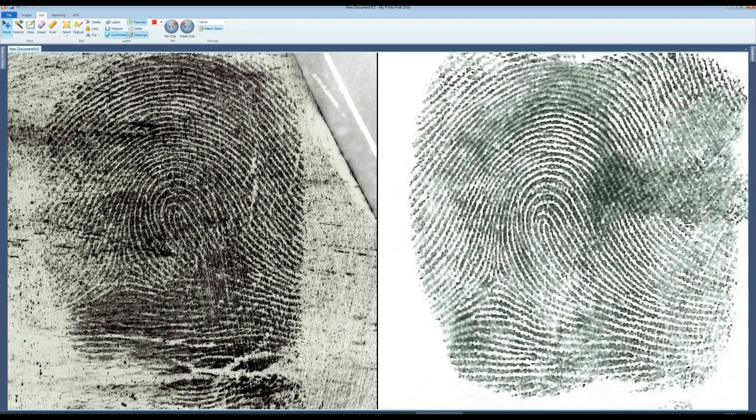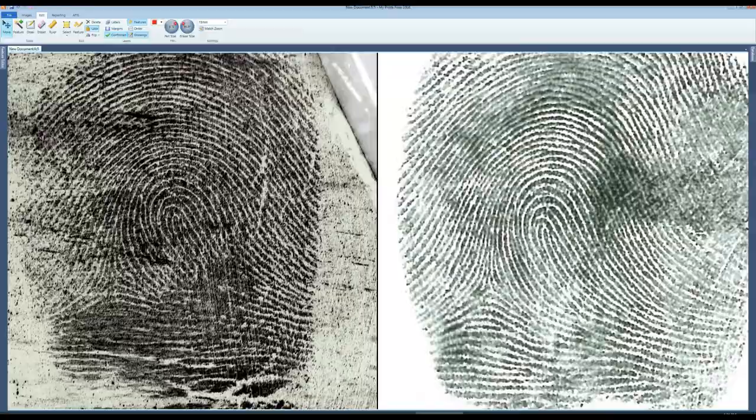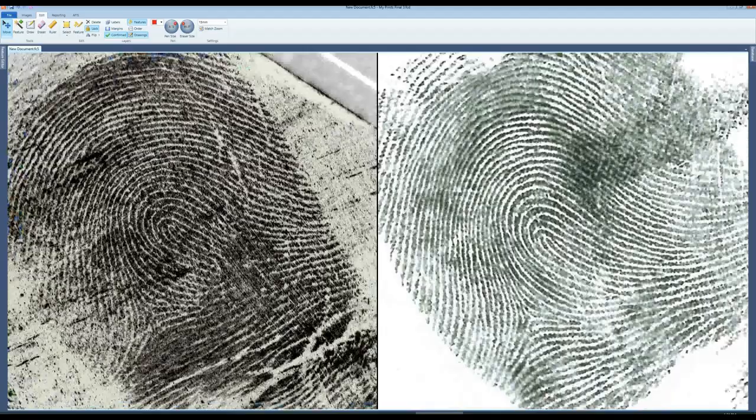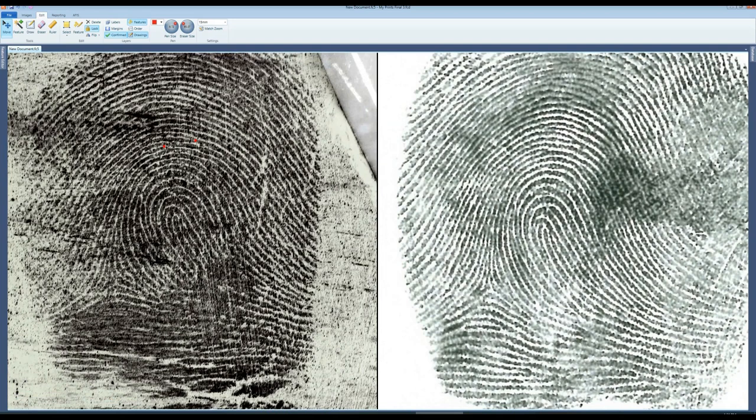Select match zoom to make images the same scale. Selecting lock here will ensure both images move in unison. The operator can then start the comparison process.